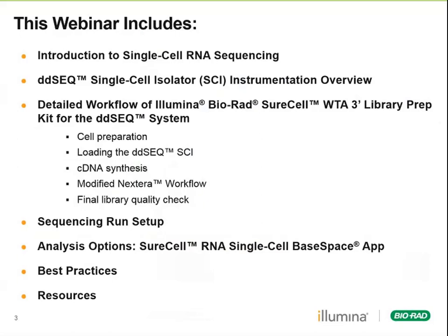We'll do a brief overview of how to set up a sequencing run and the supported analysis options. Then we'll spend some time in best practices so you can focus on the most important steps, and I'll leave you with a couple of resources for further learning.